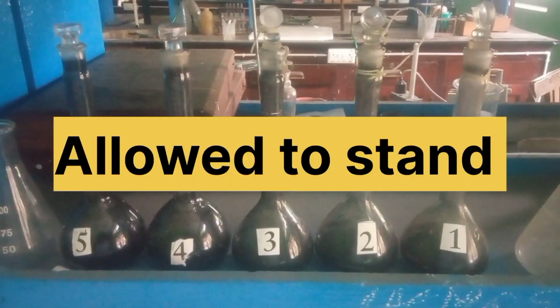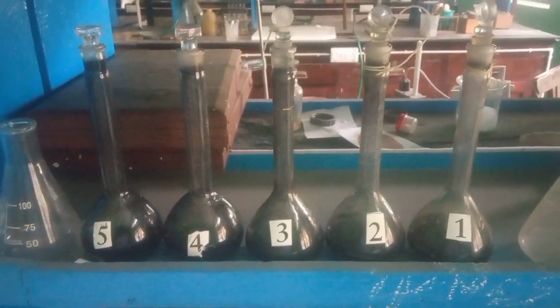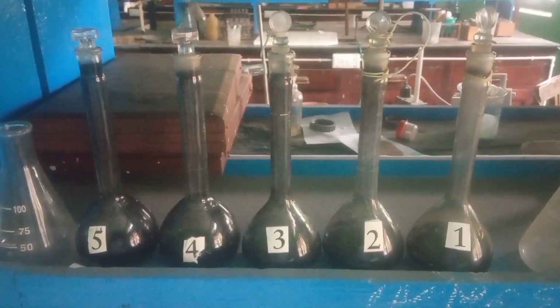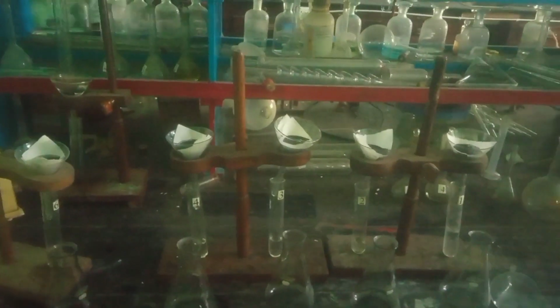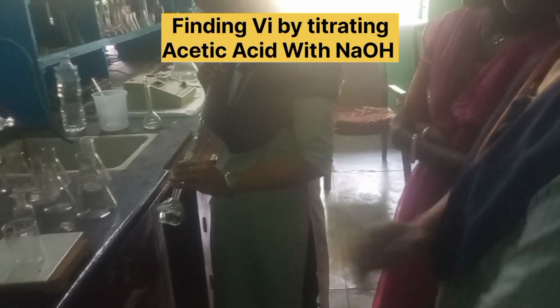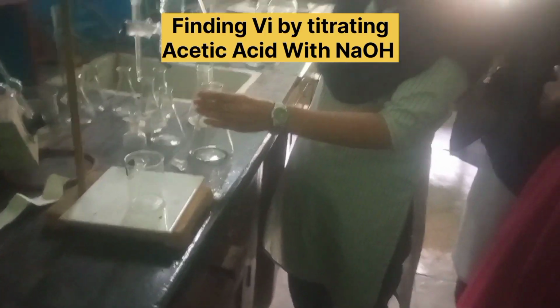After taking weighed amount of charcoal, all the flasks will be filled with acetic acid of 0.1 M concentration, and the flasks are allowed to stand and filtered into the numbered boiling test tubes. After that, the filtrate is taken and titrated against 0.1 M sodium hydroxide solution.